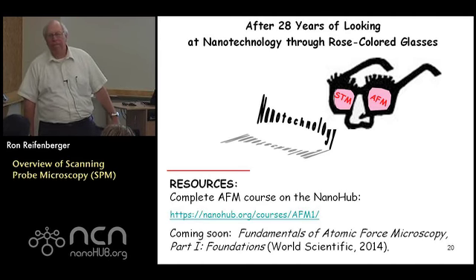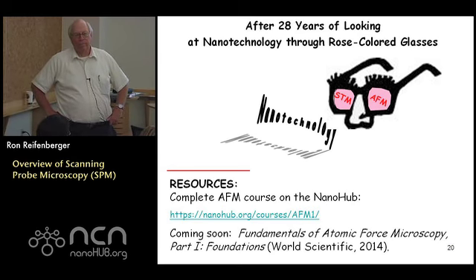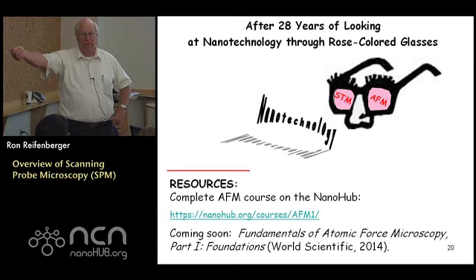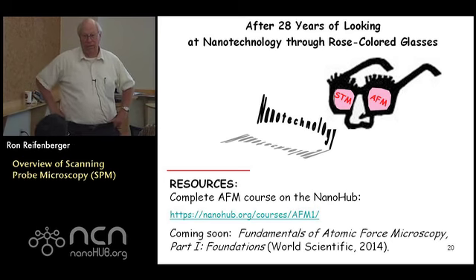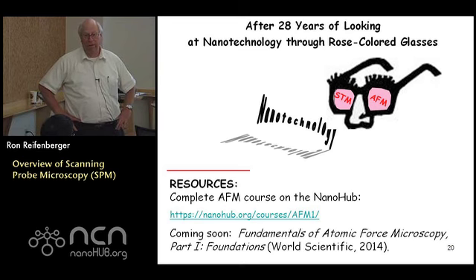Are there any other kinds of microscopy that people are trying to develop now? Well, there are advanced types of optical microscopy, right? There are advanced types of electron microscopies, right? So some electron microscopes, for instance, use the spin of electrons to get information about the magnetic properties of a sample. So I would call that a specialty application of an electron microscope.